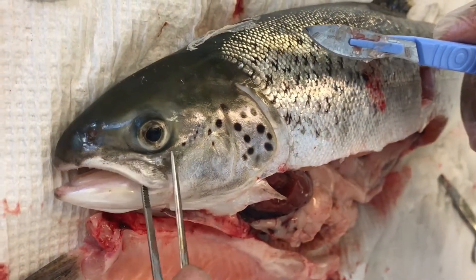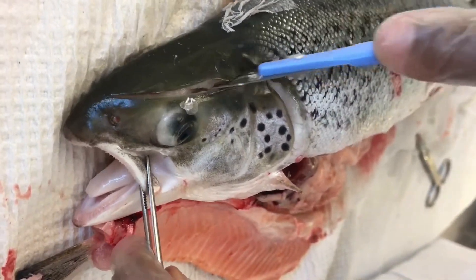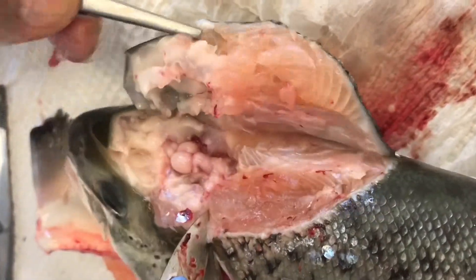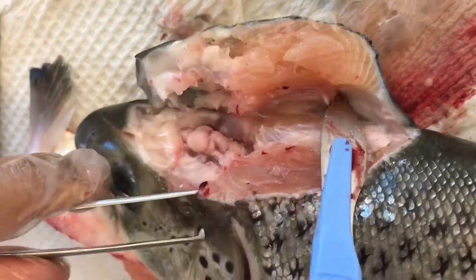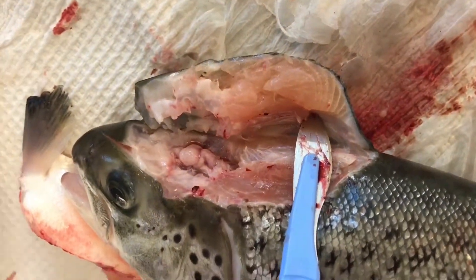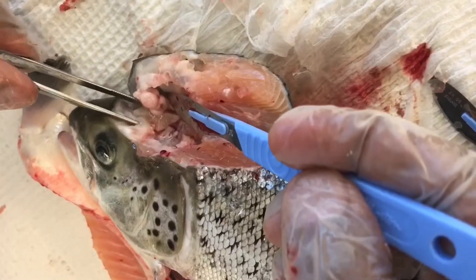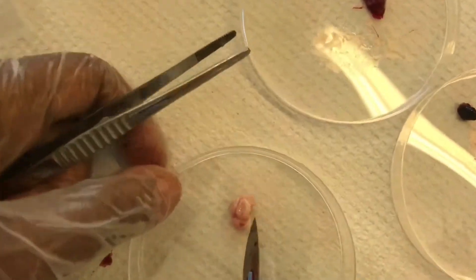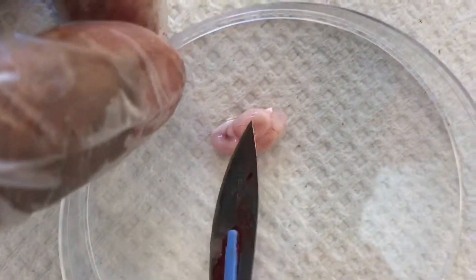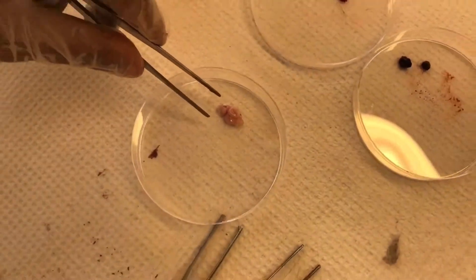Now we'll try to take out the brain from this fish. Here is the brain tissue. Take it out very carefully so as not to damage the tissue. Do not use a hooked or toothed forceps. All parts appear to be included, so this can go directly to the preservative.